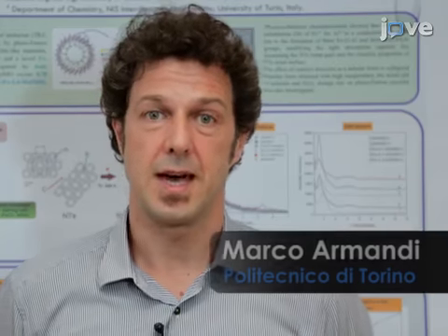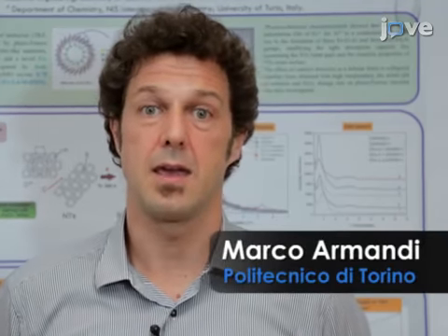Surface iron(III) sites form adducts with ionic azo dyes, which can be used to investigate electrostatic and ligand interactions at nanotube surfaces. Visual demonstration of this method is critical, as the formation of nanotubes strictly depends on using the proper synthesis conditions.